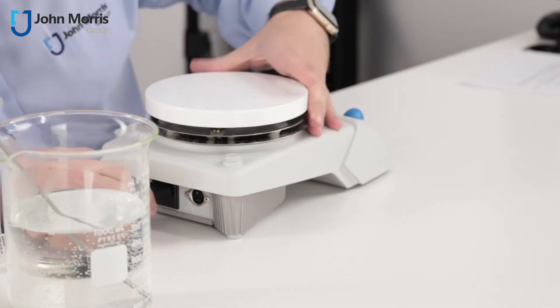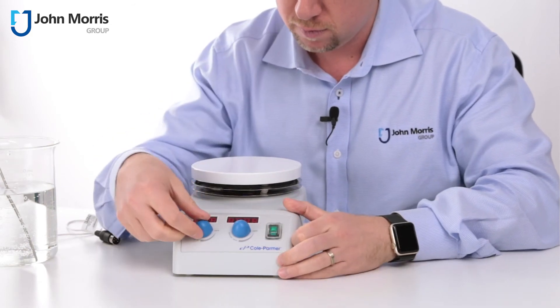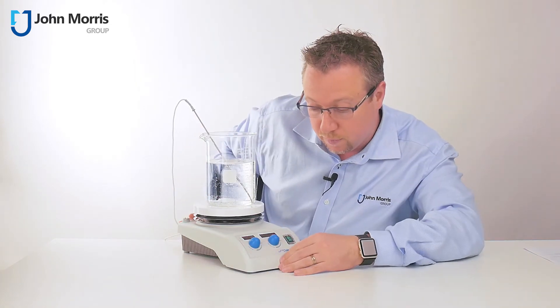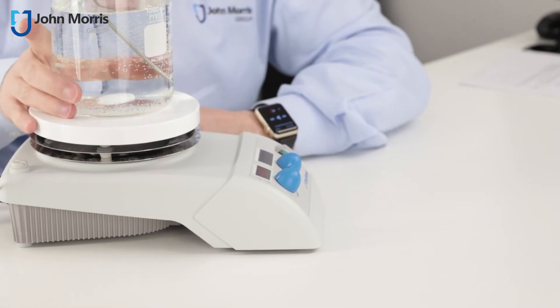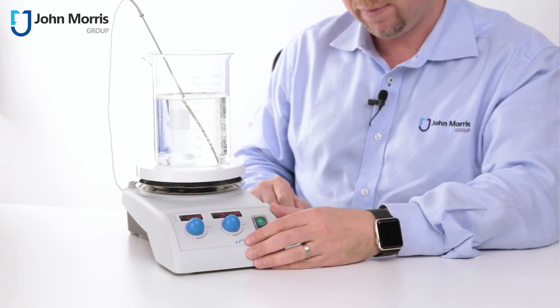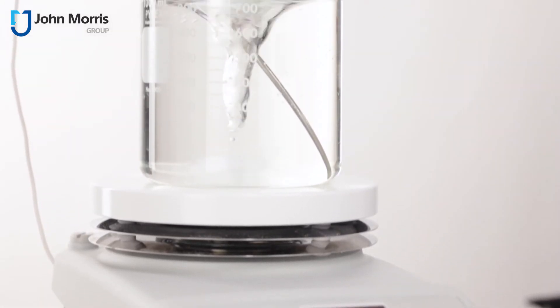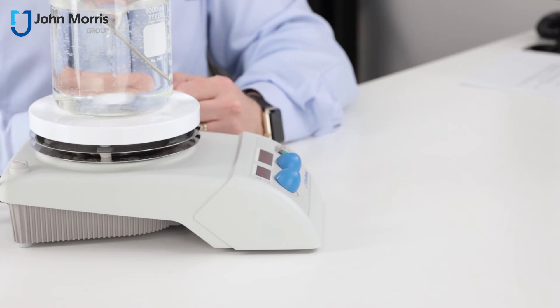If we plug the unit in, you'll see that it's got a nice clear digital display which is easy to read across the room. And if I plug in our temperature sensor, when I turn it on, you can see that we're currently at 40 degrees inside the sample. If I turn the stirring on, you can see we have nice fine control and a reasonably strong magnet. I'll show you how we can tell it's quite a strong magnet — when we ramp up in speed, we won't lose the flea. Notice the ramp is quite gentle as it's getting to speed, and this is quite a trick if you don't want to lose the flea.